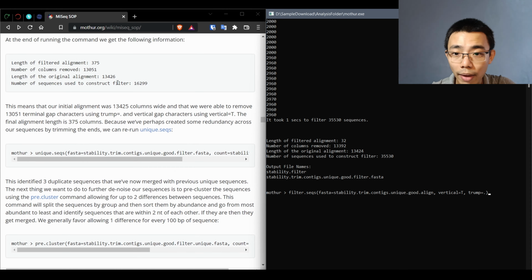So how it works is, remember the spiking that we talked about in the beginning, where we have a mock file or mock FASTQ inside our sample. Those are added in as part of the analysis so that we know if our analysis has gone wrong. So first thing first is to get.groups, so we can isolate which one is the mock information. We only want the mock information to come off right here. So we have 64 unique sequences. We have a total of 4,000 sequences in our mock data.